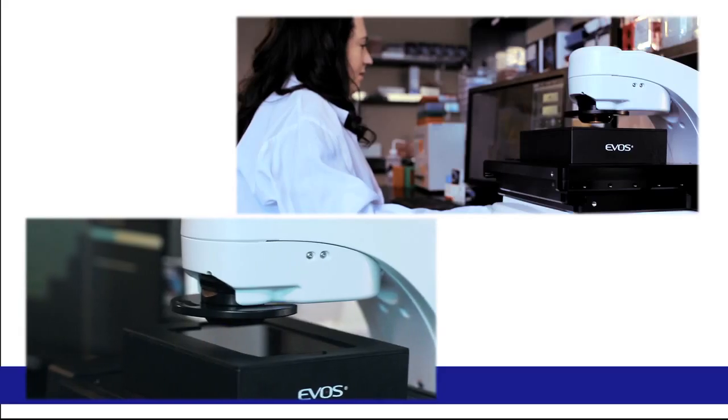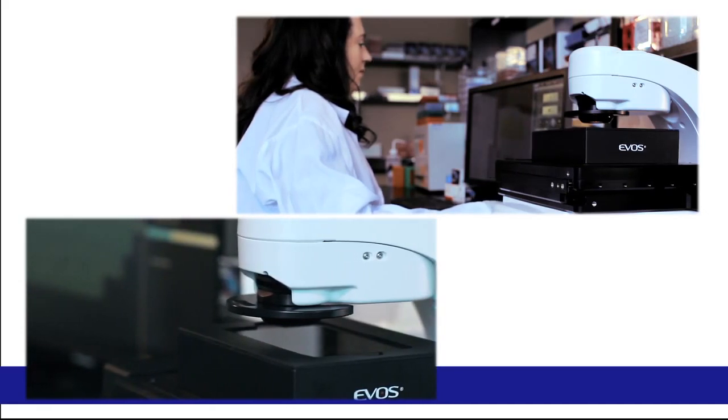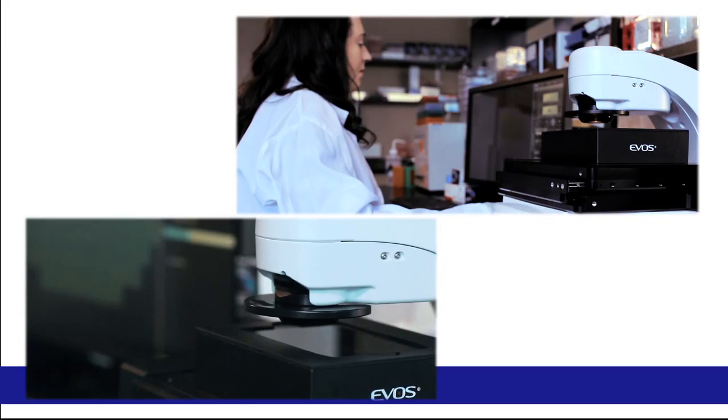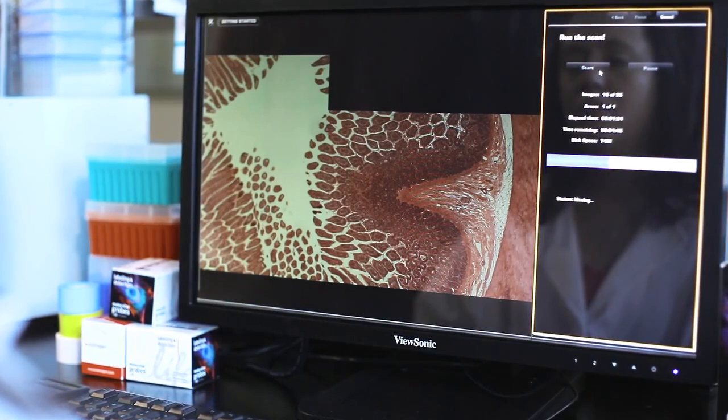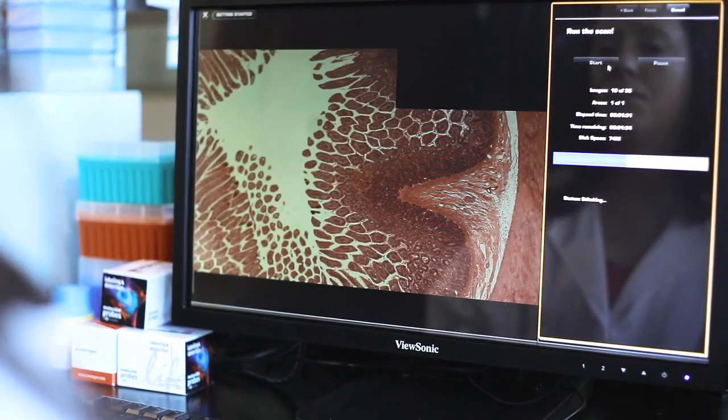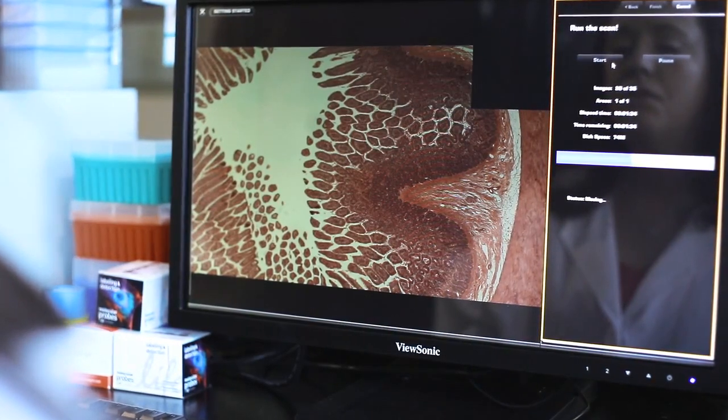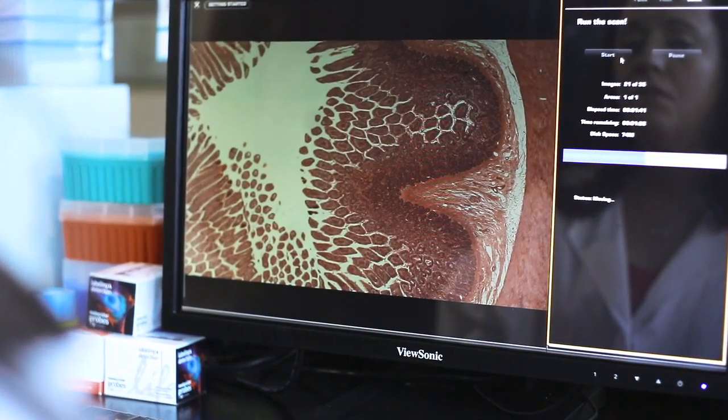The EVOS FL Auto is capable of a number of applications that have traditionally been reserved for large, well-funded labs or imaging core facilities. The EVOS FL Auto will capture higher magnification sequential images within a sample area or well, and then stitch them together into one image, allowing users to create high-resolution images that can also be viewed at a macro level.